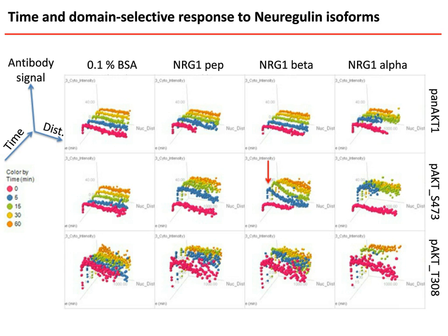Let's go to the third row, way to the bottom. Another phosphorylation event, on threonine 308, also shows, if you remember from the last slide, that much of the colony responds to some ligands. Here, all the cells are essentially at a high level and don't really change much with time.